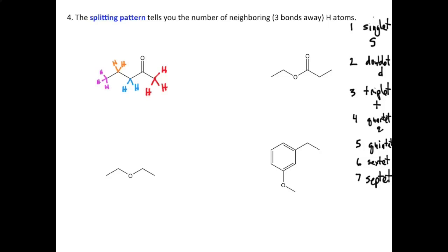Right, and anything greater than that, we usually use M for multiplet, and that means we have a lot.